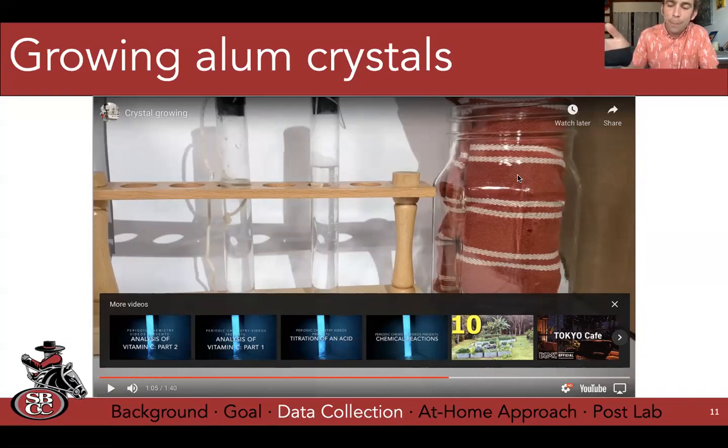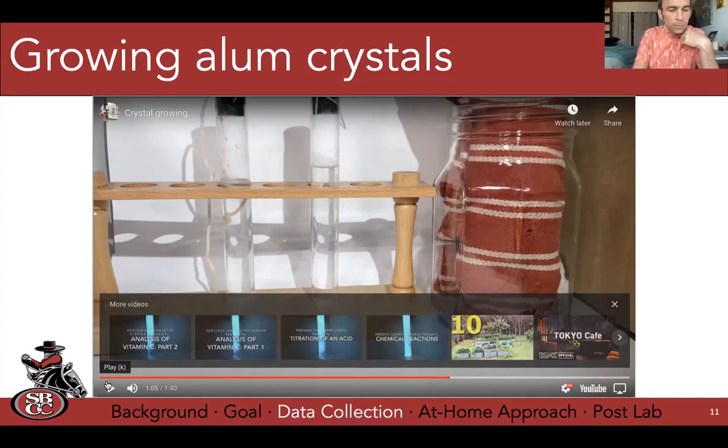So what do you think is going to happen for the solution in which I've wrapped the towel around the solution? Not a trick question. The heat will leave slowly. Yeah, slower. So we're going to change how we're cooling it down, right? This is kind of the first hint of how open-ended this project can be, but understand that once we do everything that I just showed you, now is where the thinking begins. Because now you have to figure out how to get that saturated solution to make a lattice around your seed crystal perfectly. And that's not totally simple.